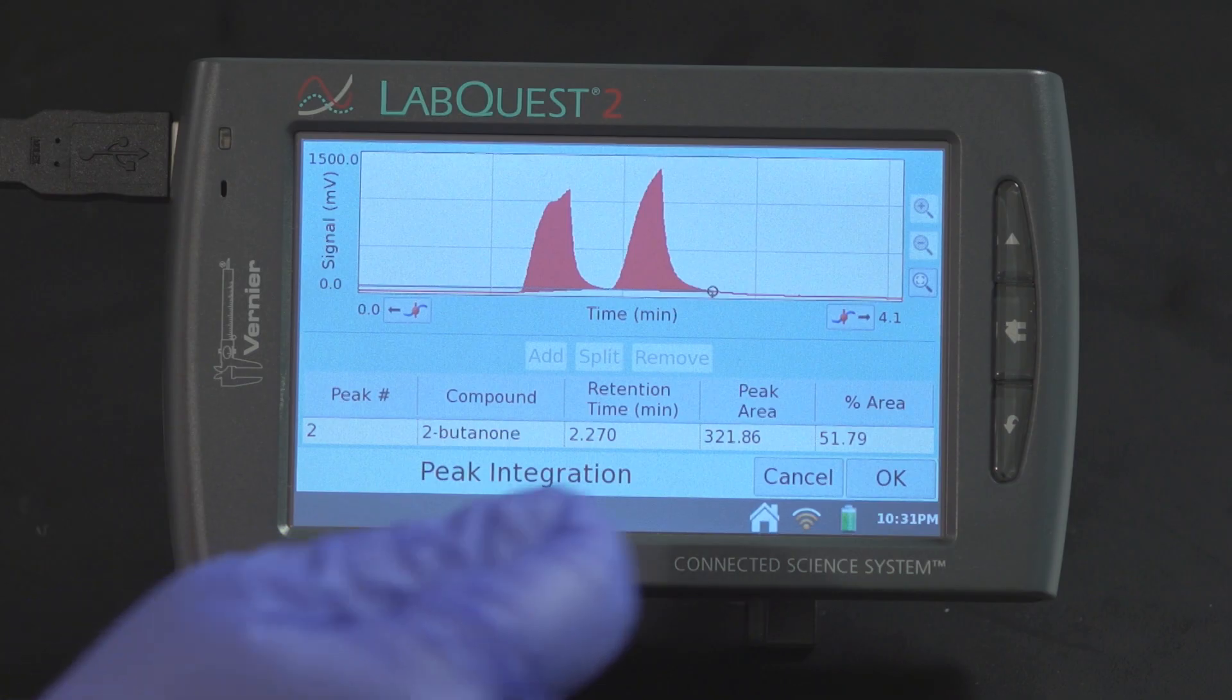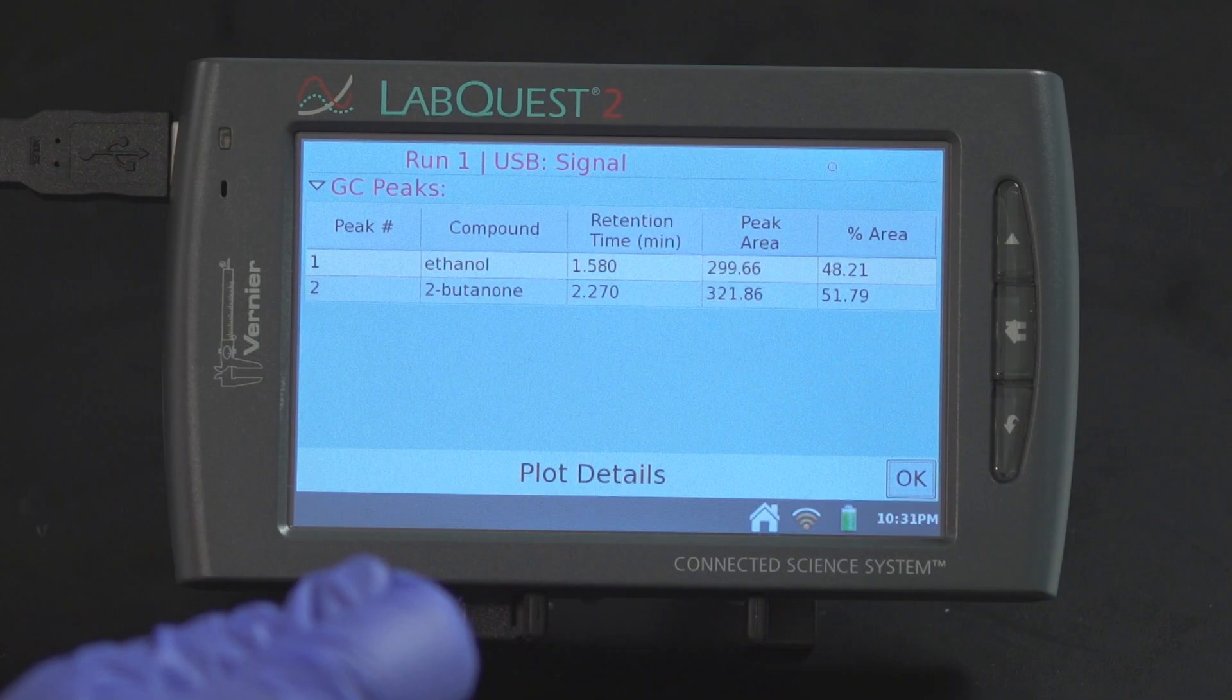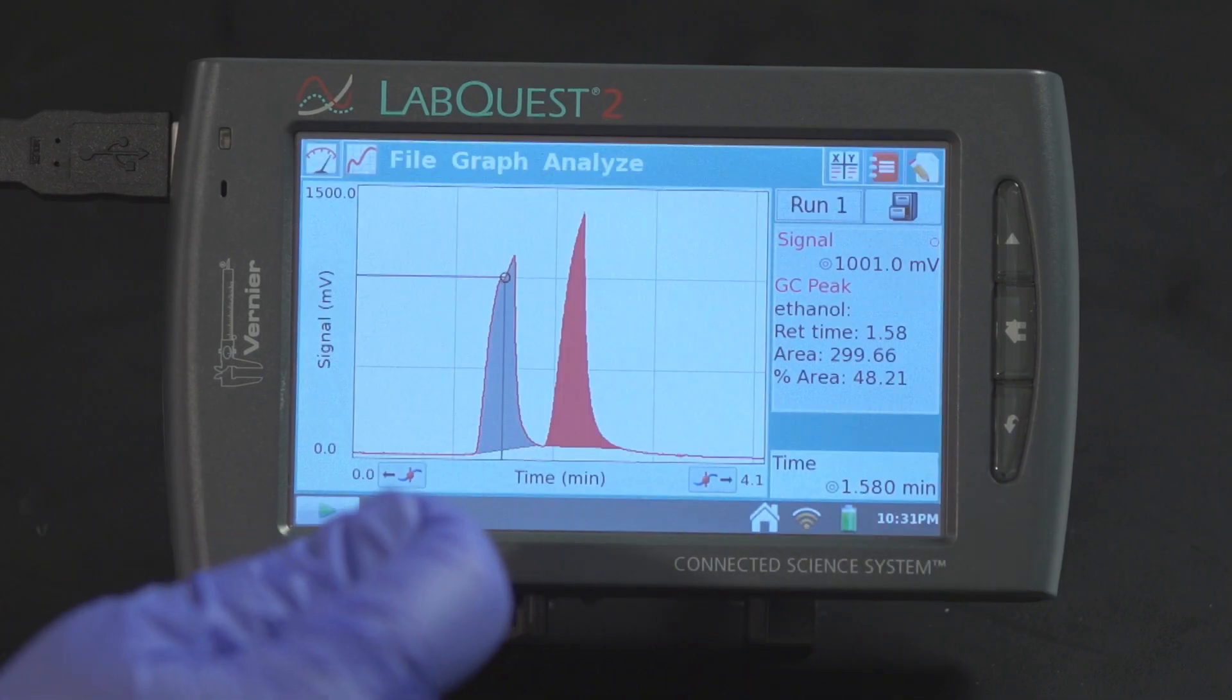When you're complete, press OK. This will bring up the plot details. Then select OK to return to your graph.